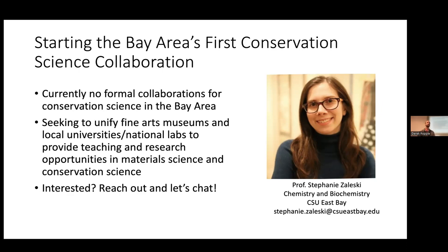It's at Lawrence Berkeley National Lab, which is just up the hill from campus. As part of their user facility called Molecular Foundry, they have a separate building that's an electron microscopy facility. They have 5 or 10 of these instruments at price tags ranging from 1 to 10 million. So these are incredible resources that we have here that are unmatched in a lot of areas.